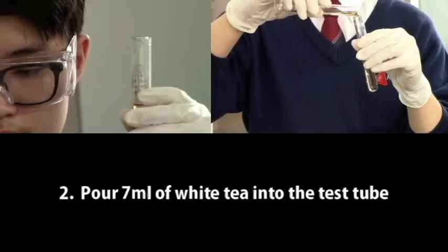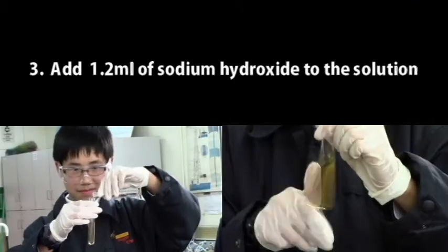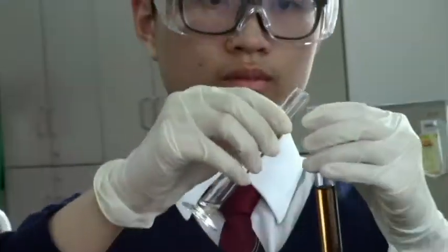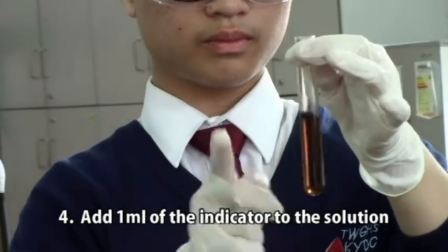Pour 7 milliliters of white tea into a test tube. Add 1.2 milliliters of 1 molar sodium hydroxide to adjust the pH value. Add 1 milliliter of the indicator obtained from the first step to the mixture obtained in the second step. Stir well.